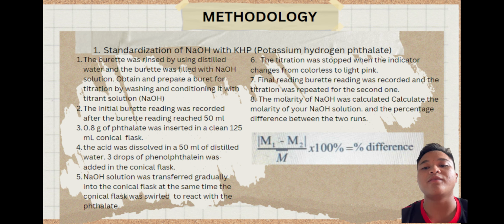The molarity of sodium hydroxide was calculated using the calculation below.